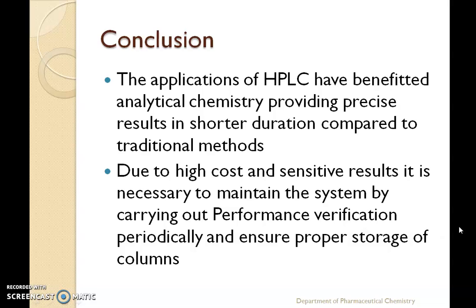Then finally what I want to conclude is that maintenance of the column and maintaining proper storage and all these things are important aspects in HPLC, where you can do a lot of work. And as I discussed, with UPLC the latest technology has come, so the column plays a very important role.